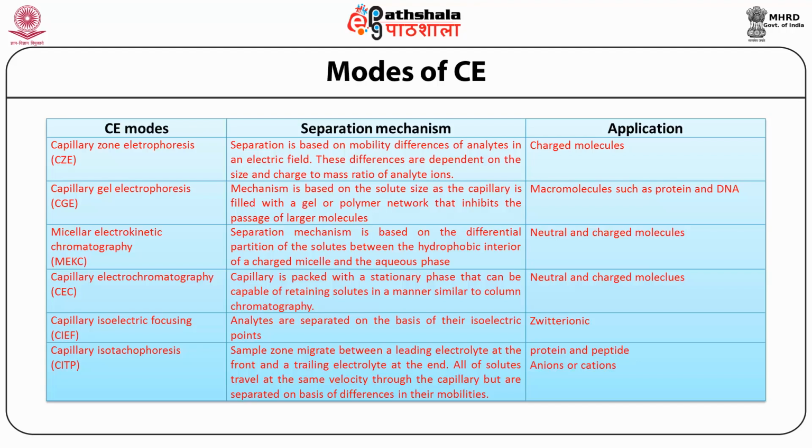Let us talk about capillary electrochromatography (CEC). The capillary is packed with a stationary phase that is capable of retaining solutes in a manner similar to column chromatography, and this can also be used for neutral and charged molecules. Next, capillary isoelectric focusing (CIEF). In this separation mechanism, the analytes are separated on the basis of their isoelectric points.